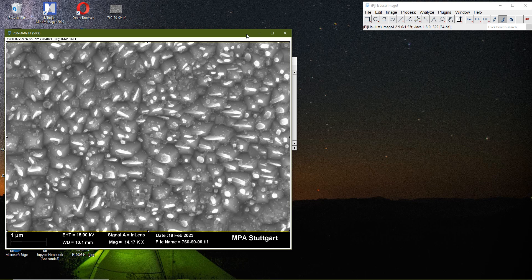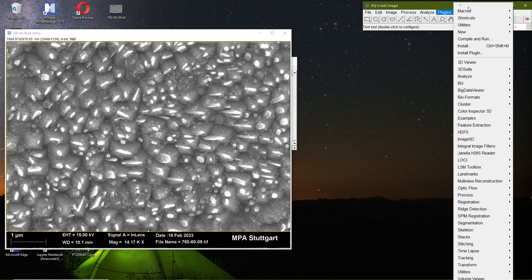I keep all the files in one folder and they all have their own names — the same base name but with new extensions and suffixes. This makes it much easier later to run a Python script on the whole folder, which can read all these files and make sense out of them. I've also written a macro that automates a few of these steps so you have to click less.